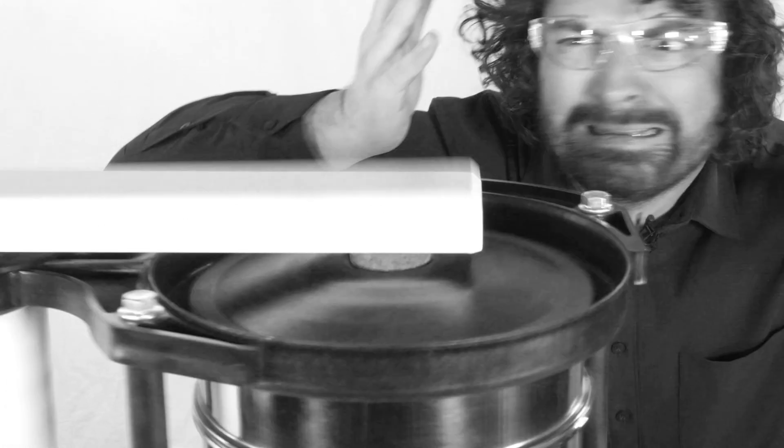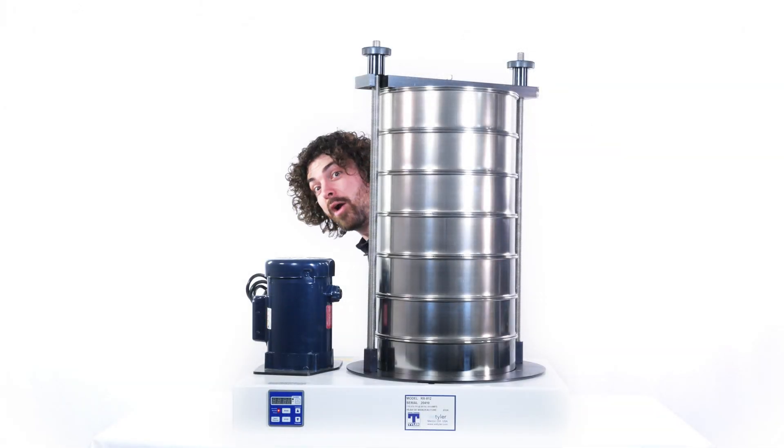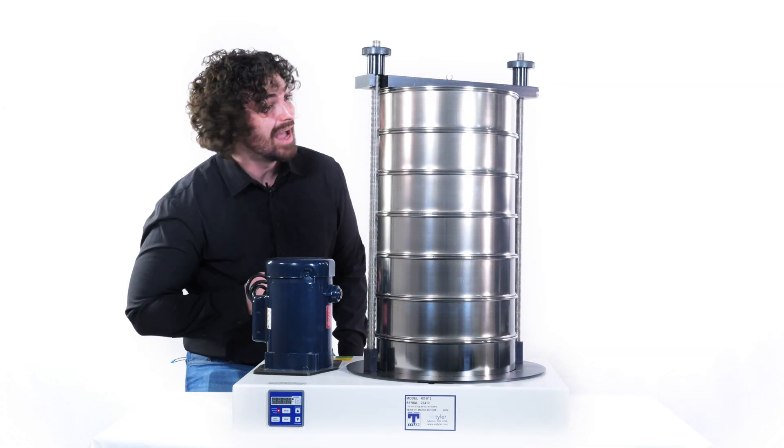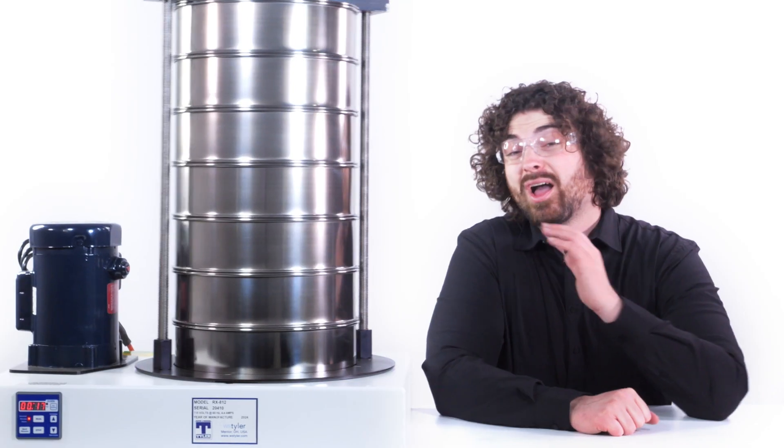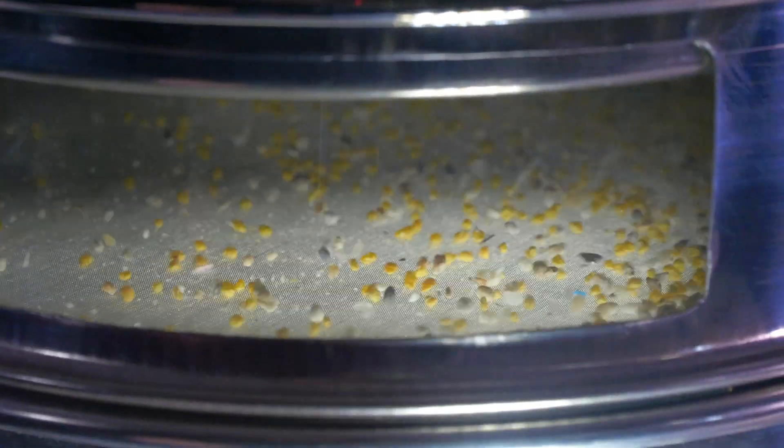Do you find yourself getting really annoyed by that noisy banging sound that comes with the tapping part of the Ro-Tap? Well, if you're using 100 mesh sieves or coarser, then the RX812 is the shaker for you. As you can see, no hammer. The oscillating motion is actually enough for the particles to find the openings. But for particles finer than 100 mesh, you can't run them through the RX812 — the particles won't consistently find the openings without the brute force hammer tap.